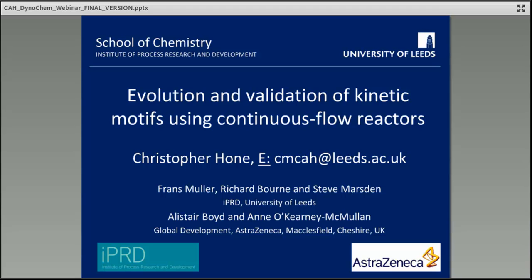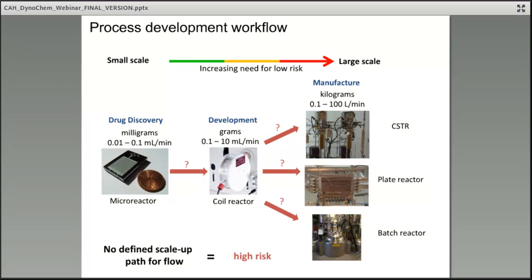So today I'd just like to give you an overview of the approach that I've been implementing as part of my PhD. So I'm going to first introduce the concept, the idea of fitting simplified kinetic motifs and using continuous flow. I know that the batch reactor is historically what's used within the pharmaceutical industries, but what flow offers is that completely different operating region.